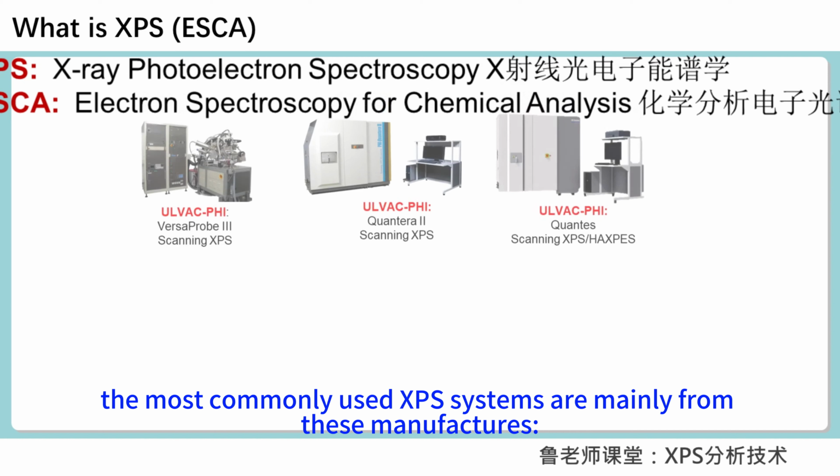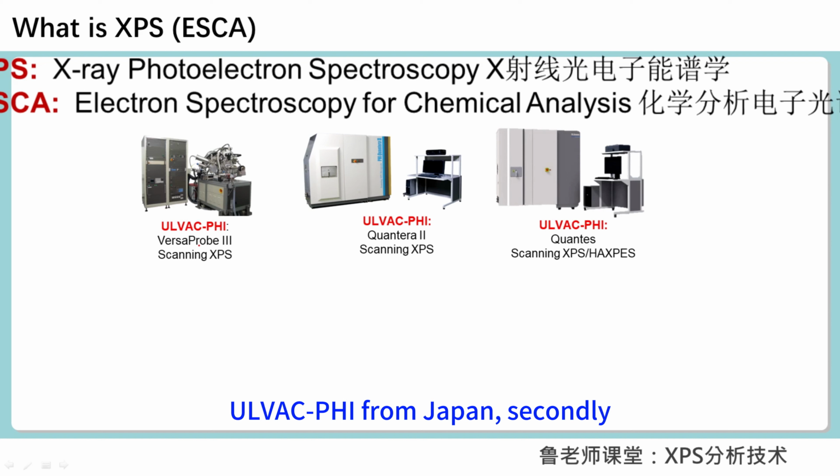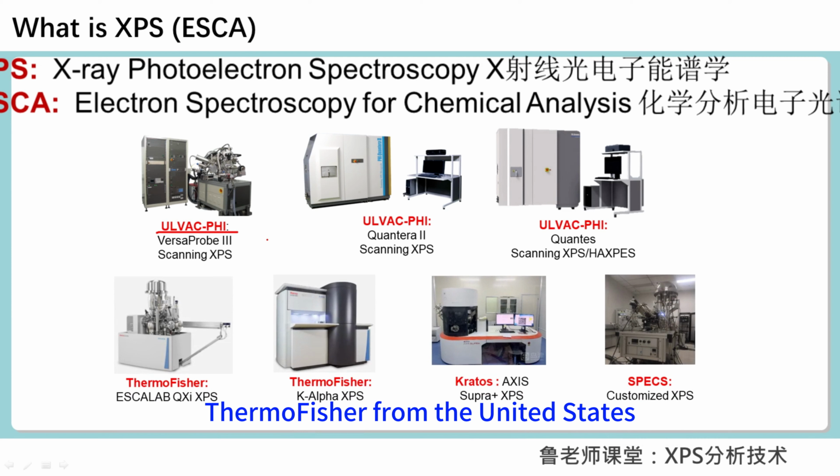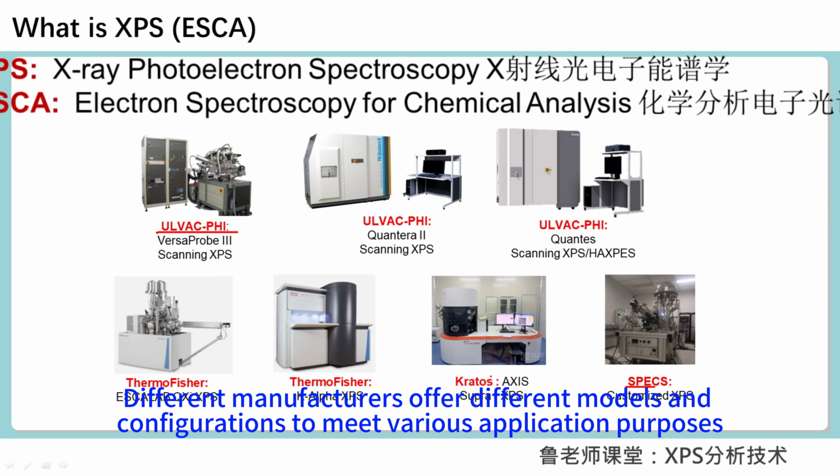Currently, the most commonly used XPS systems are from these manufacturers: Ulvac-Phi, Thermo Fisher, Kratos, and Specs. Ulvac-Phi, Thermo Fisher, and Kratos offer commercial XPS systems, while Specs provides customized systems. Different manufacturers offer different models and configurations to meet various applications.